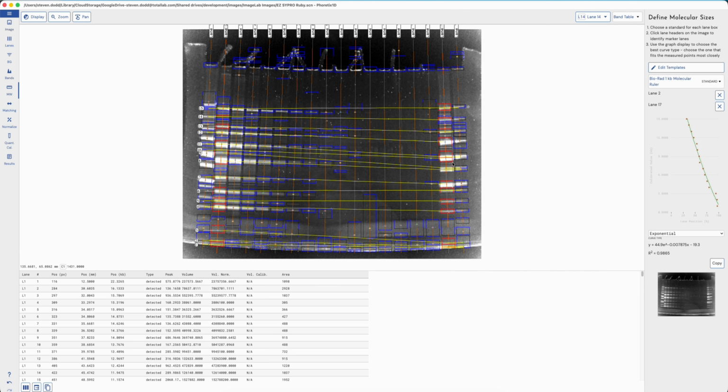I've got more videos on our YouTube channel if you go through the Phoretix 1D playlist about all the different advanced features that we've got here. But by doing this, we've removed a significant barrier from people using Bio-Rad equipment, thinking they may be locked into using the Image Lab analysis software with that equipment, allowing users to have a choice.